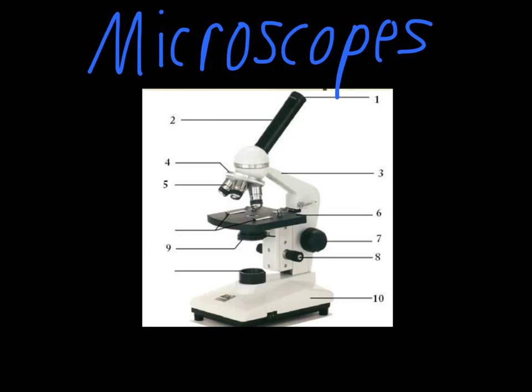Nine times out of ten, if somebody tells me their microscope is broken, it's just because the diaphragm is closed. If the diaphragm is closed, it's not letting any light up through your light source, which ends up traveling up through the microscope and through the ocular lens. You can actually see whatever you're trying to look at there on the stage. So, that's always the first thing to check if your microscope isn't functioning correctly. Sometimes this can get bumped when they're being put away. It can just slide closed. So, you move that one open. Generally, you want them all the way open, allowing the maximum amount of light through.